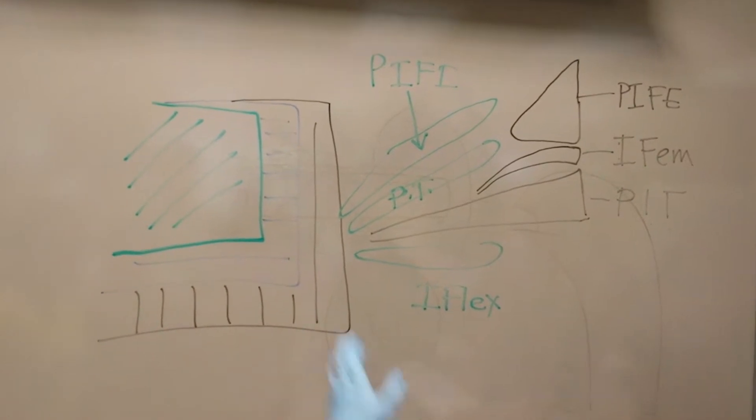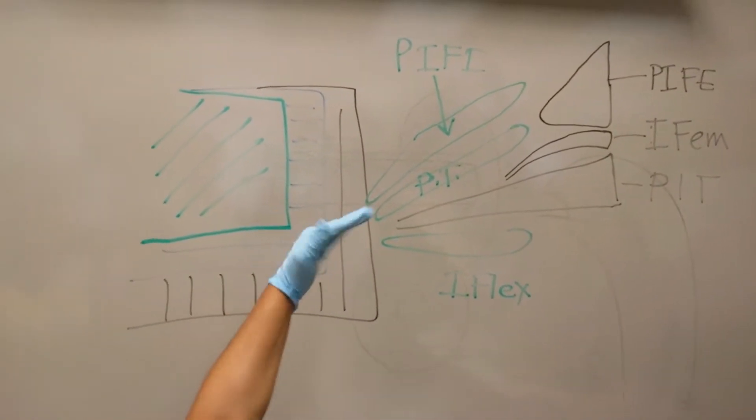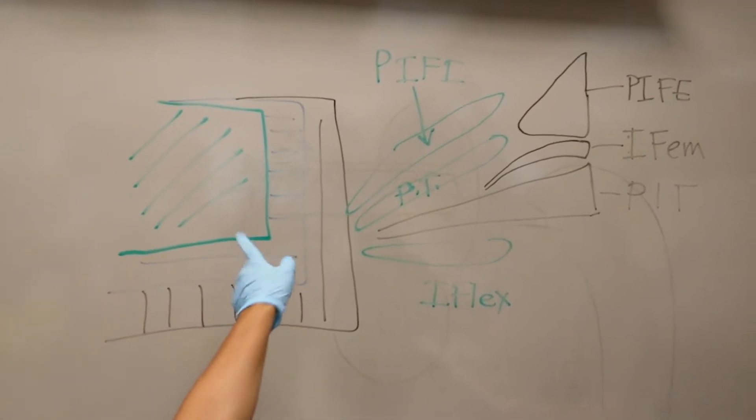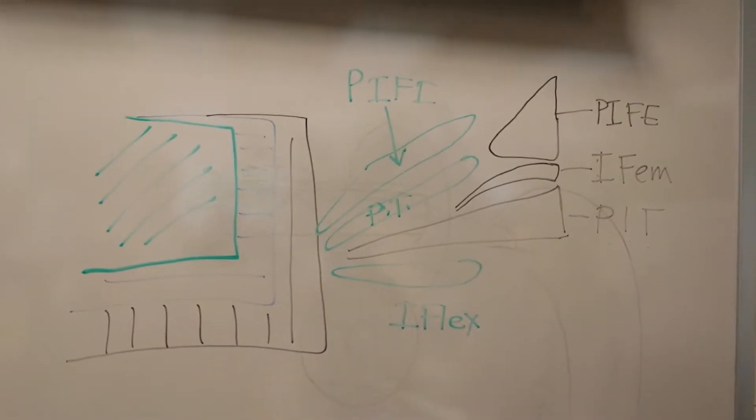The way to recognize these is that the muscle fibers run in certain ways. External oblique will be on the diagonal, internal oblique will be horizontal, and your rectus abdominis are clearly vertical.